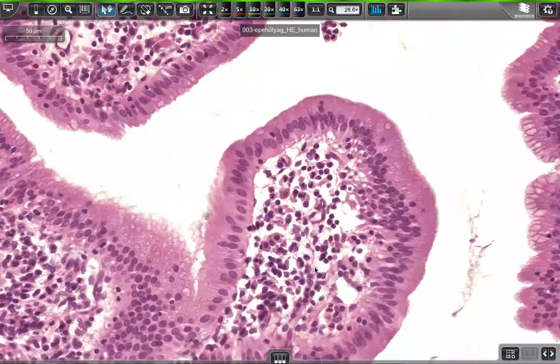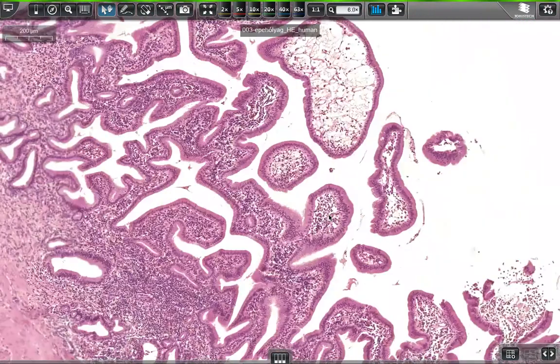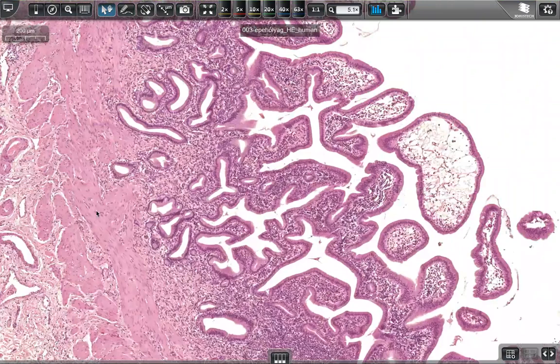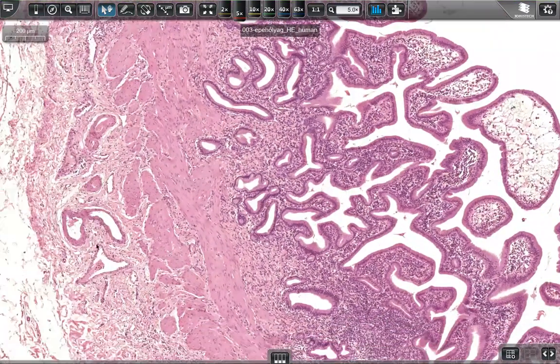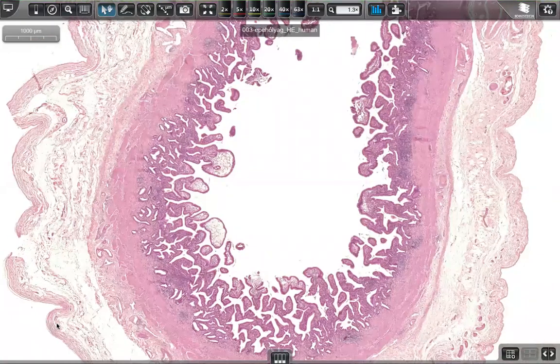Then that's the lamina propria, which is a cellular-rich connective tissue, and underneath the lamina propria here, immediately the muscularis externa begins, having the smooth muscle fibers there, and under it there is connective tissue. It depends on the exact location of the gallbladder.